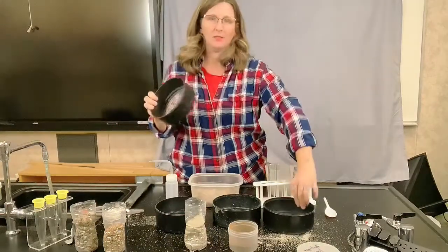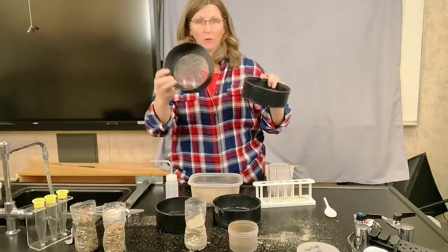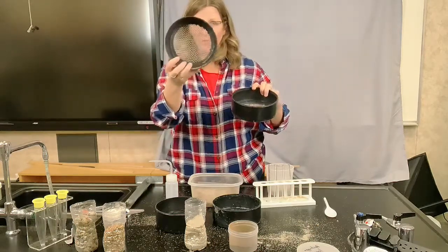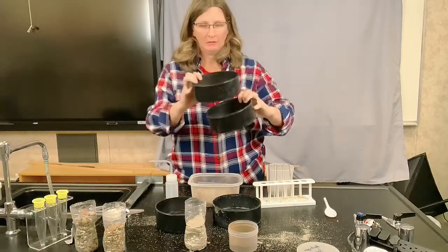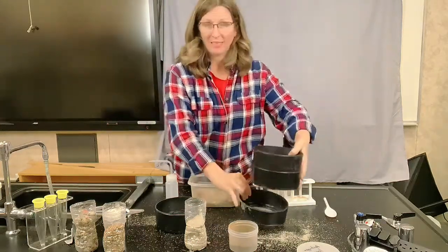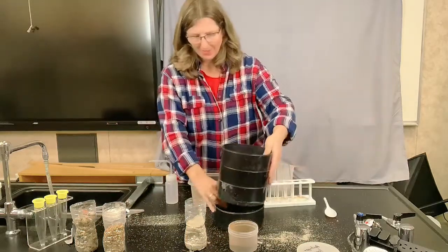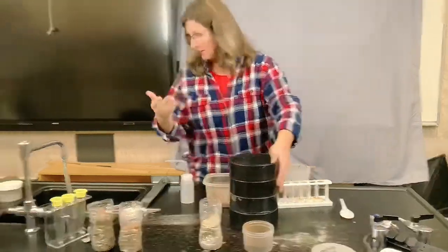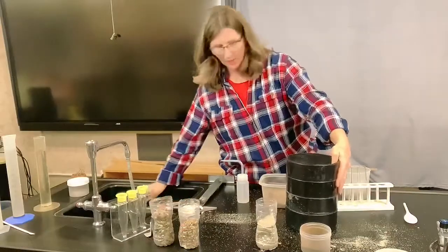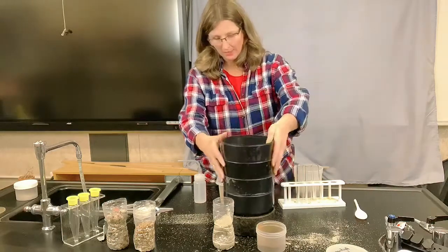I'm going to show you one way that we will be doing sorting by size, and this is with a sieve system. All right, and we have different grades of where the particles would go through. So that's large, medium, smaller for sand, it's a grit 60, and then a grit 230. And that grit is the same kind of grit as on sandpaper. And then the last tray would be collecting our fine clays.